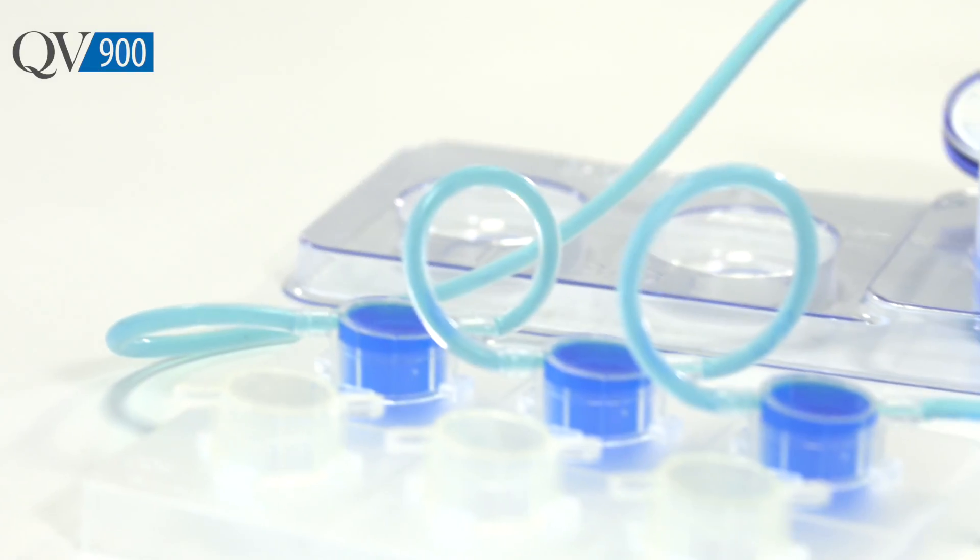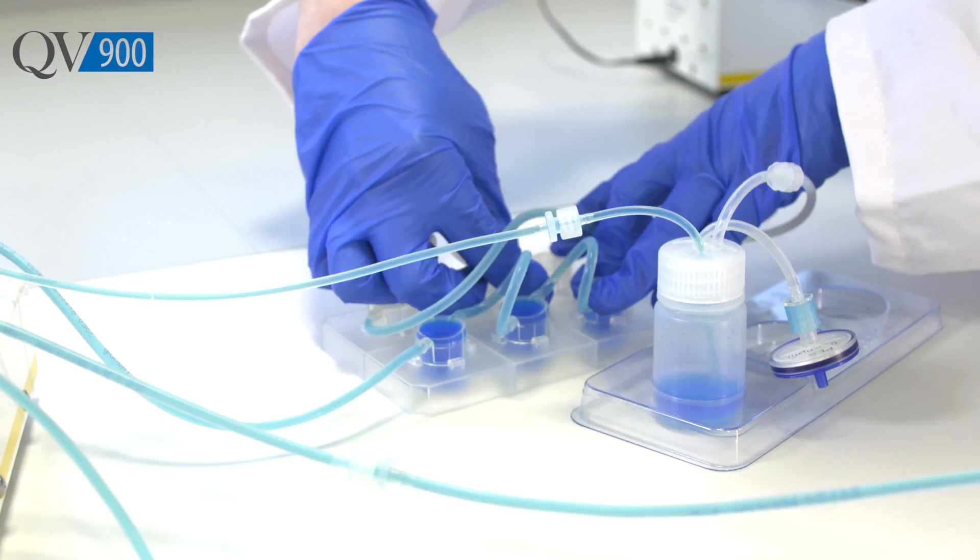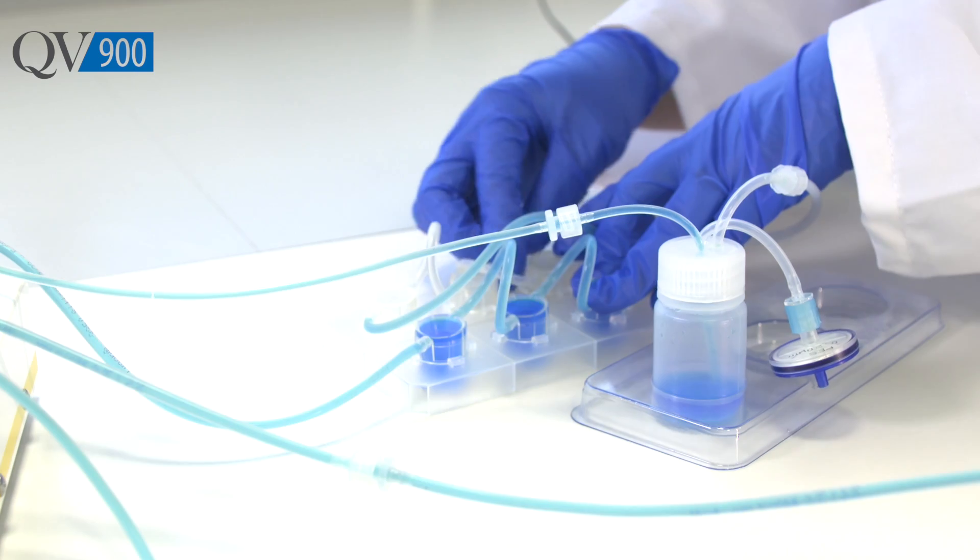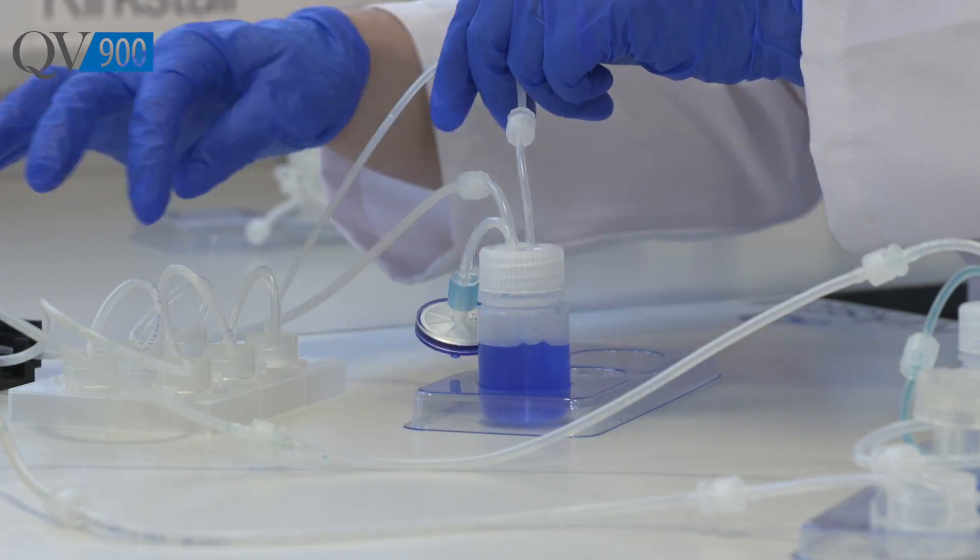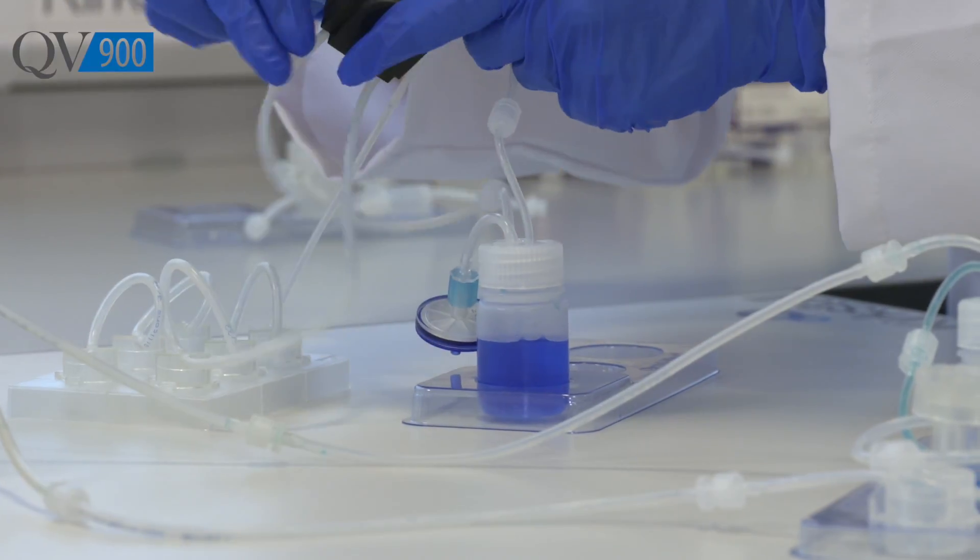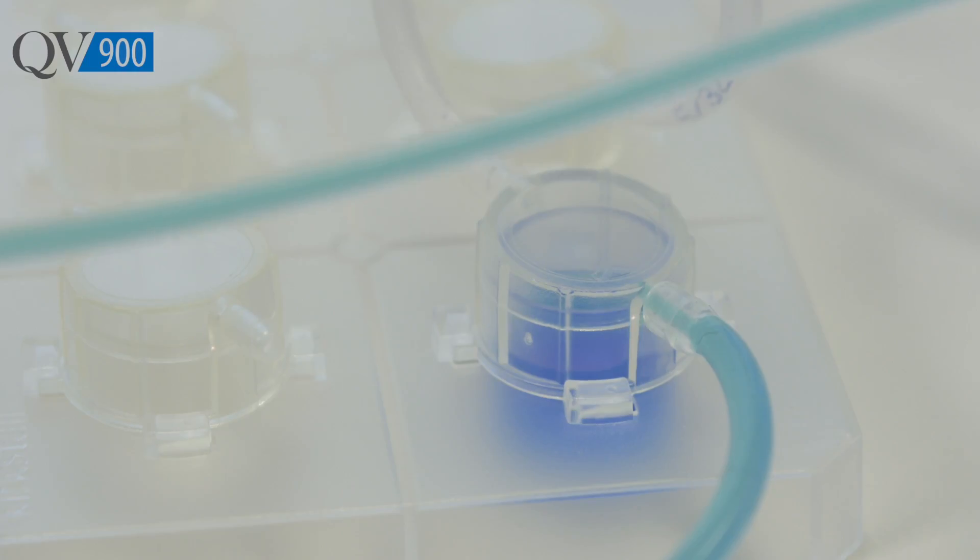The QV900 was specifically designed for use in industry who recognized its significant potential but wanted a higher throughput standardized Quasivivo system. It consists of six chambers on a standard multi-well plate footprint and is made from a material with little to no non-specific binding.